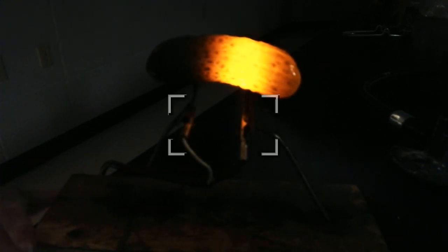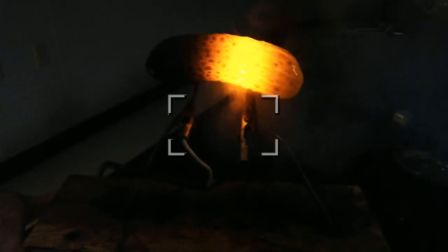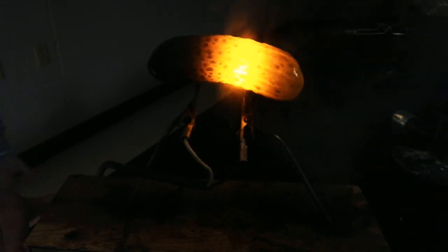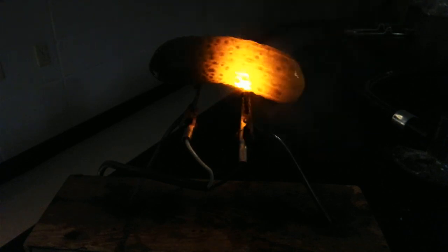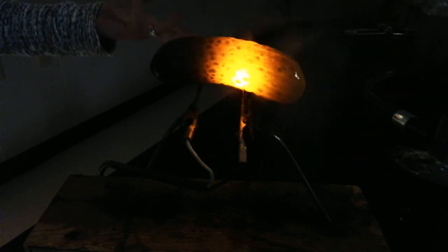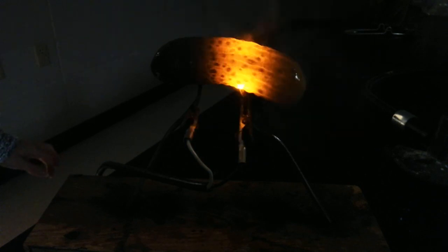Oh my gosh, you gotta be kidding. Check it out, it's that yellowy orange color. It's the exact same color that we got from the flame test, because the flame test shows the color of the sodium. So whether it was from a pickle that had sodium chloride, or from the solid sodium chloride that I tried, you should still see the same representative colors when you do this flame test.